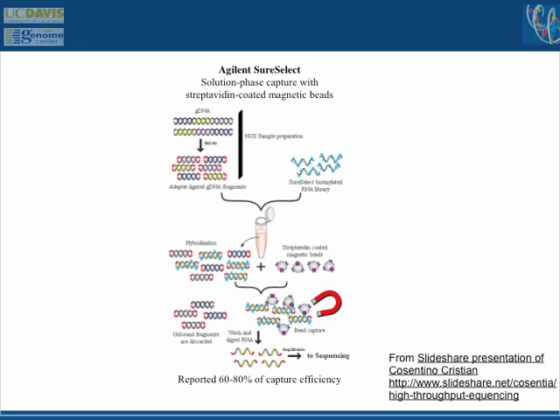But the challenge is you have to pair that to making Illumina libraries. So it has to be set up such that you can, in a high throughput manner, feed your SureSelect products into making Illumina libraries. Now Agilent sells robots for like $1 million that pair up with the SureSelect system and will make your library for you, making 96 libraries in a day, or something to that effect. Is that more what you were referring to, like target enrichment, or it doesn't matter?